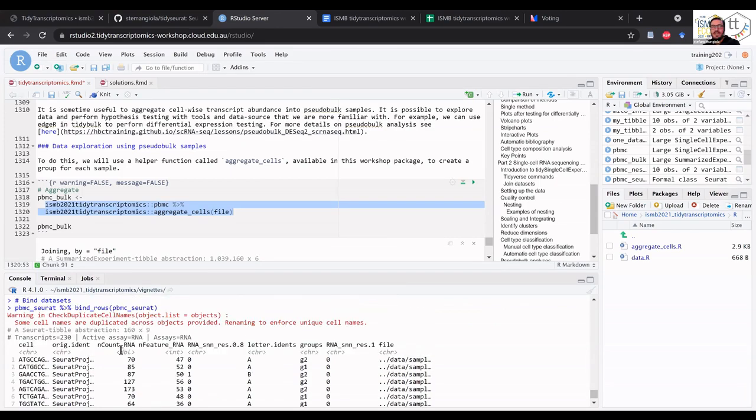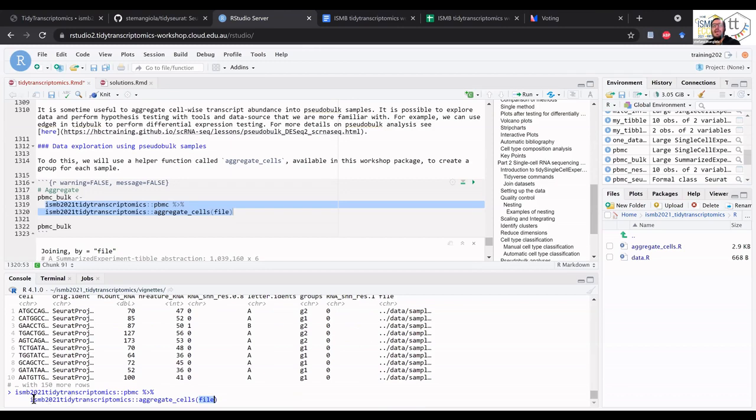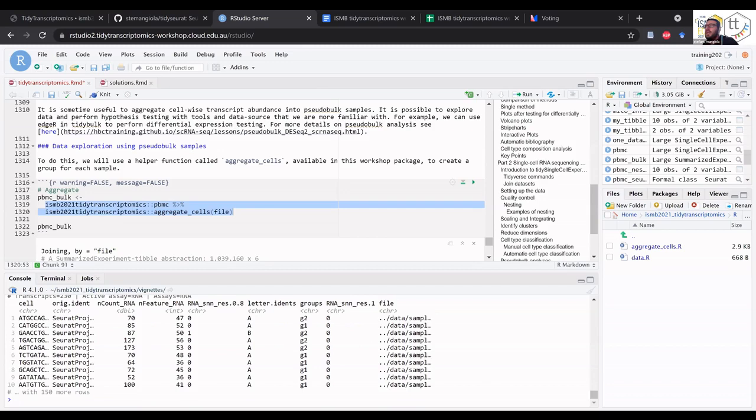Well, this is not here because we haven't predicted. But yes, you can definitely group at which level you want. Yeah, no limits, any combination of variables that you want. You could even nest your data set, aggregate within the groups, and join everything together. Everything is very modular. Pseudobulk, I mean, can you do it at different levels? Yeah, I think I answered you, but if not, let me know.